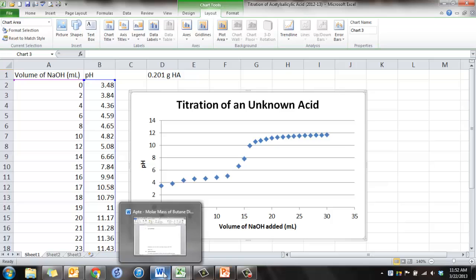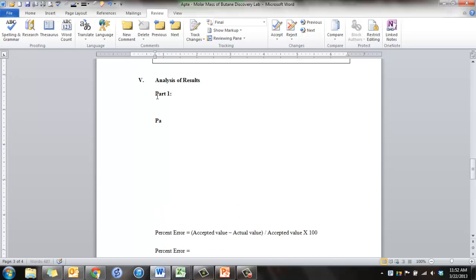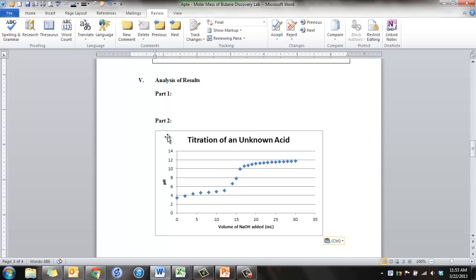And then go to your lab report and where your analysis section is. You're going to paste this in there. Your part one should actually be the calculations for that. So this graph is actually going to go in the part two, I believe, or part three. And then just paste your graph in there. So copy and paste it in.